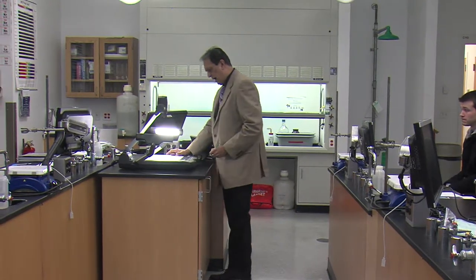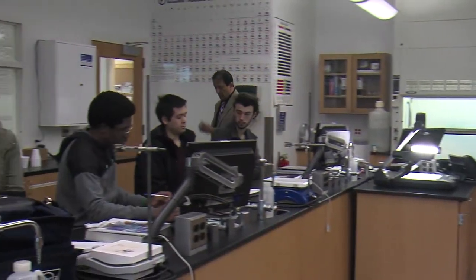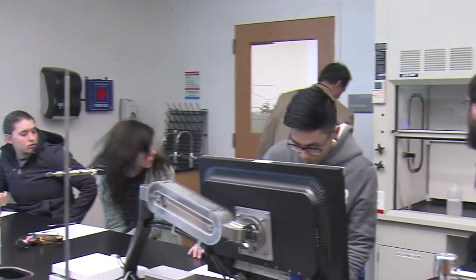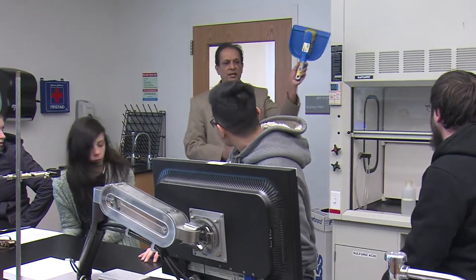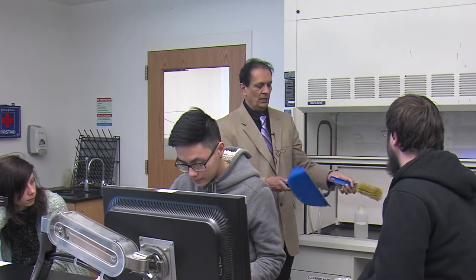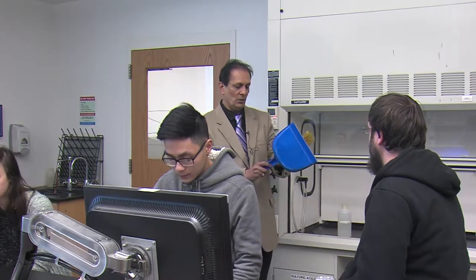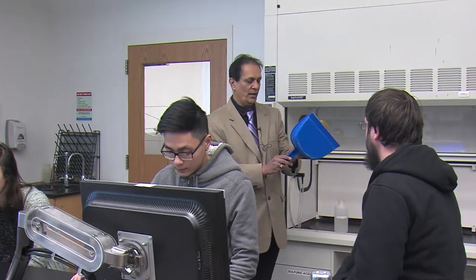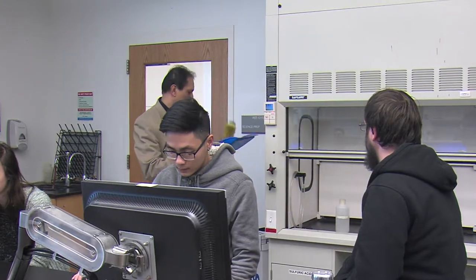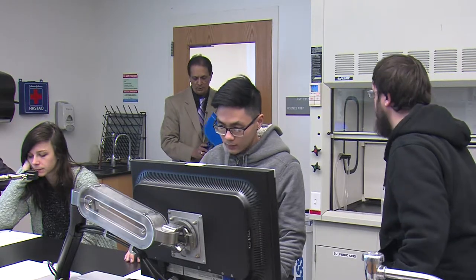Number 15, broken glass. At times, you will break some glassware, and when you break your glassware, you will come over here and grab this duster and dusting pan, all right? And you will collect the broken glass using this, okay? Not with your bare hands and cut yourself so that now you have an emergency, all right? Don't create an emergency, use this. And where do we discard this broken glass? In the broken glass bucket, all right? Over here, there's a white broken glass bucket. That's where you will discard the broken glass.